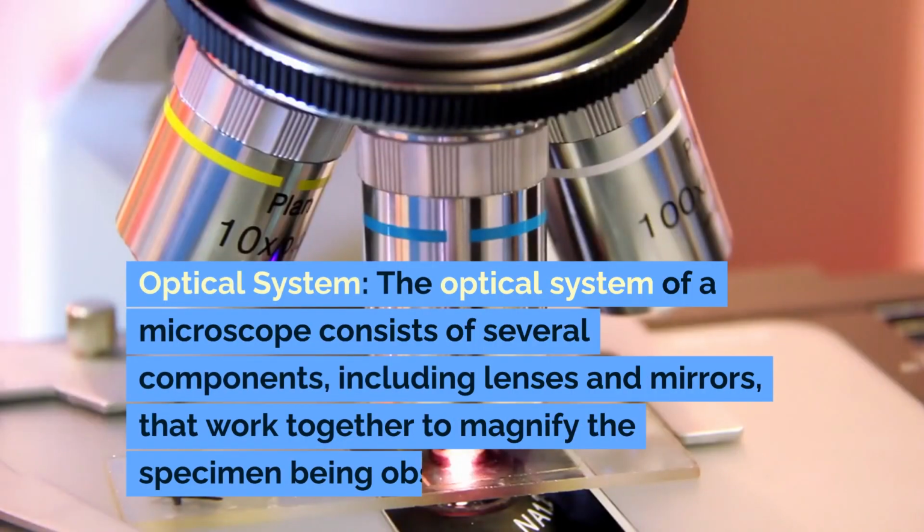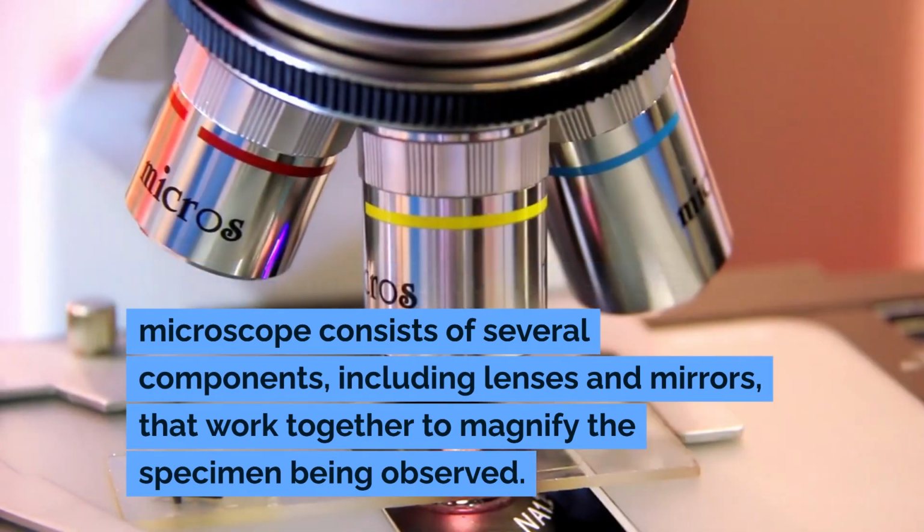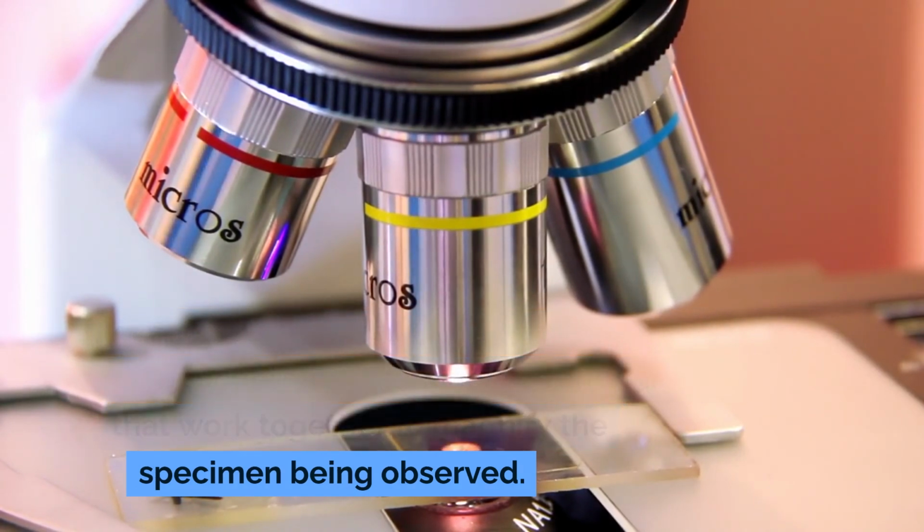Optical system. The optical system of a microscope consists of several components, including lenses and mirrors, that work together to magnify the specimen being observed.